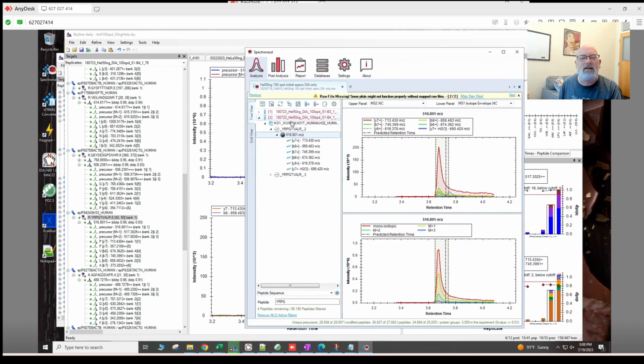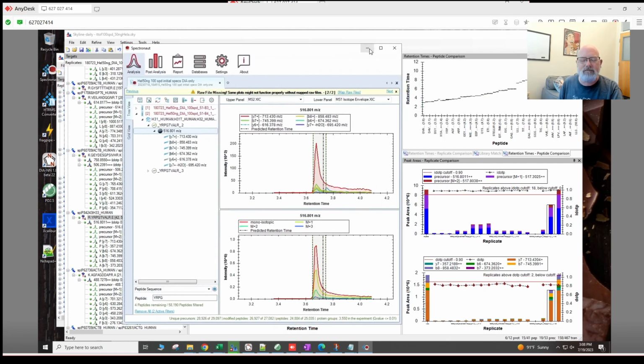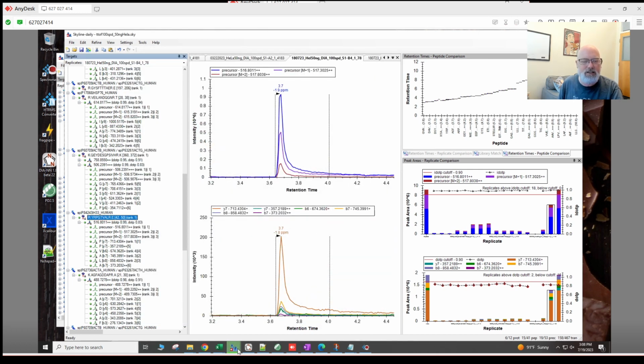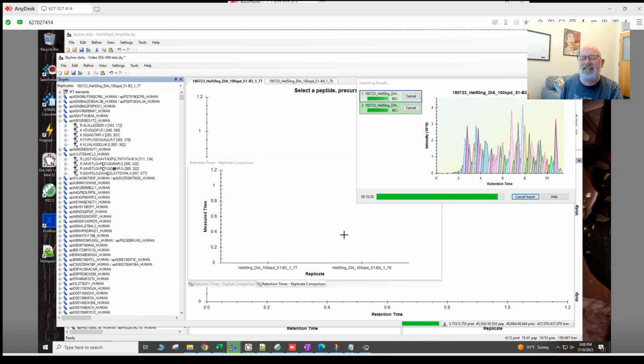But you can go back and forth. I find it interesting to go back and forth and see the difference between the two programs. All right. Let's see if it's done. Is it finally done? Almost. Almost. All right, what else can we find out about?